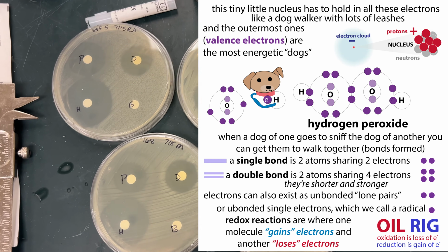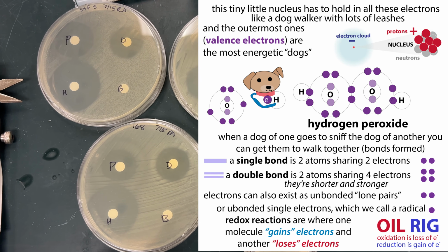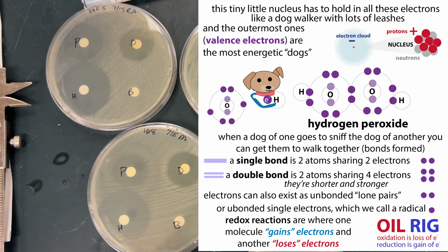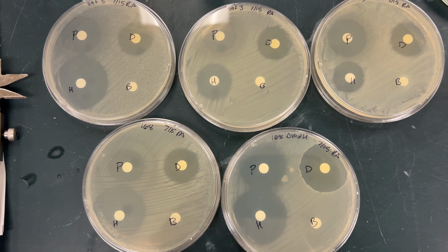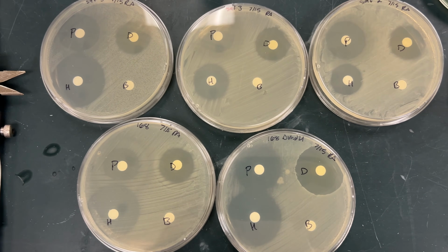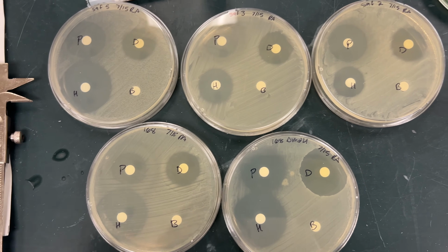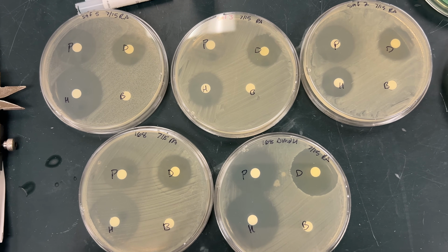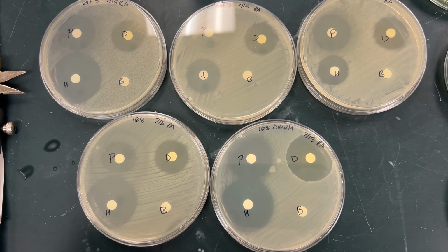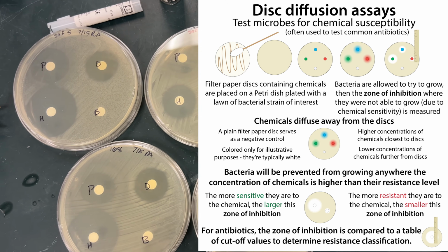and bacteria don't either. So bacteria have ways in which they can resist this. We wanted to study how well these bacteria are able to resist these various forms of oxidative stress, and see if that corresponds to their ability to resist different metals. Because we're studying bacteria that we want to use for bioremediation to remove toxic metals from the environment. Metals can cause oxidative stress, and so we want to see whether the ability of these bacteria to withstand the metals is related to their ability to resist oxidative stress in general, or whether maybe it's something different. And so this is just one way to measure things.